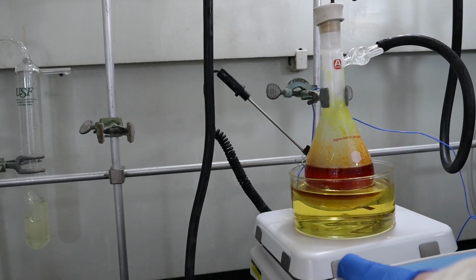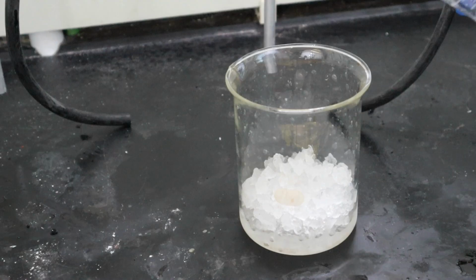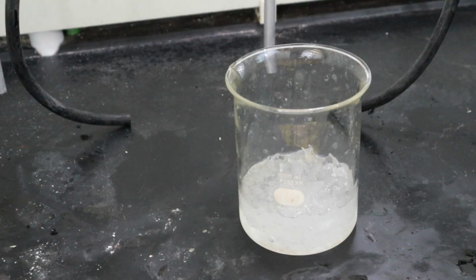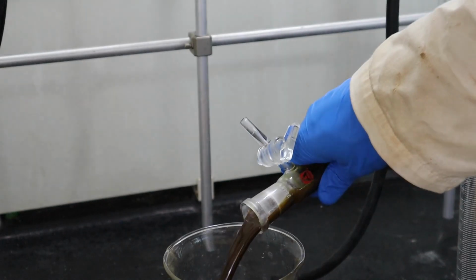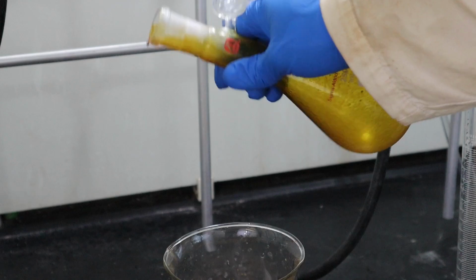I heated the reaction to 100 degrees Celsius for 1 hour. 70 milliliters of concentrated hydrochloric acid was poured over 240 grams of ice. I poured the contents of the reaction over this mixture of ice and acid. The ice quickly melted in the highly exothermic dissolution of aluminum chloride.